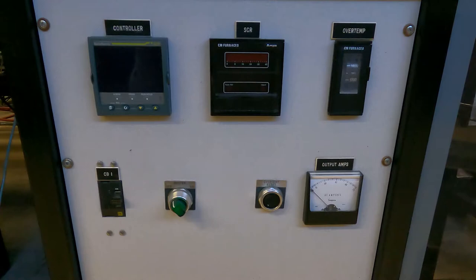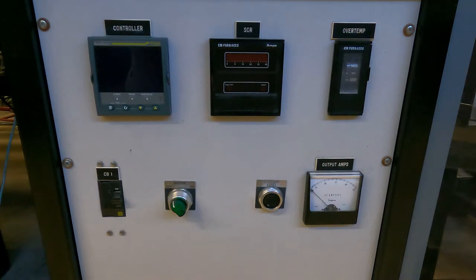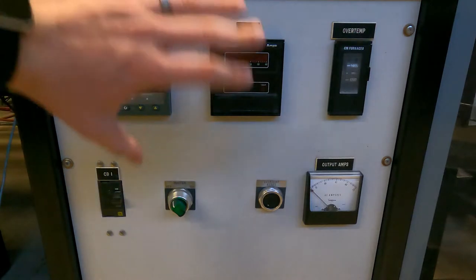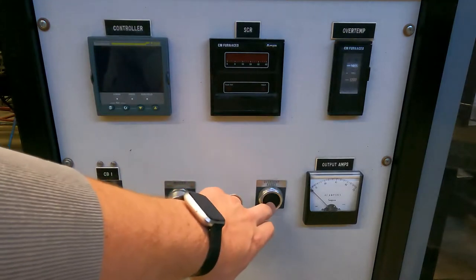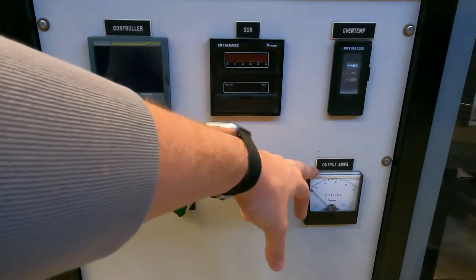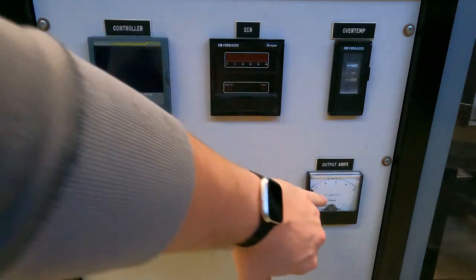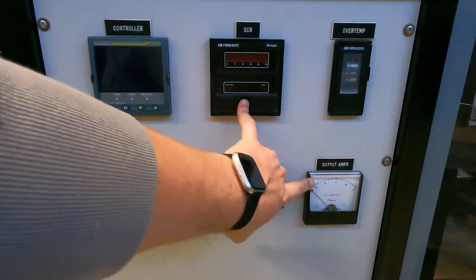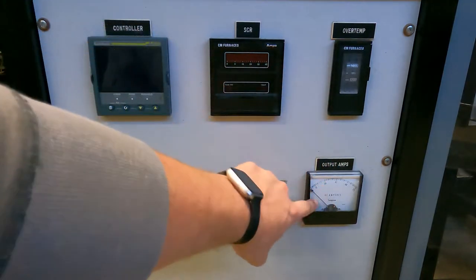So I'm just going to give you the rundown on here. If you need details on the different SCRs or overtemp or amps meters, you can do a little bit of reading on your own, or shoot me a message in the comments or an email if you have any questions on that. So just to give you a basic rundown on what's going on here, we have our master control and our circuit breaker switch. We also have our overtemp reset button and our output amps, which you can see on the SCR and on the output amps meter. They're kind of redundant, but not all the SCRs have that gauge, so we have a second gauge.